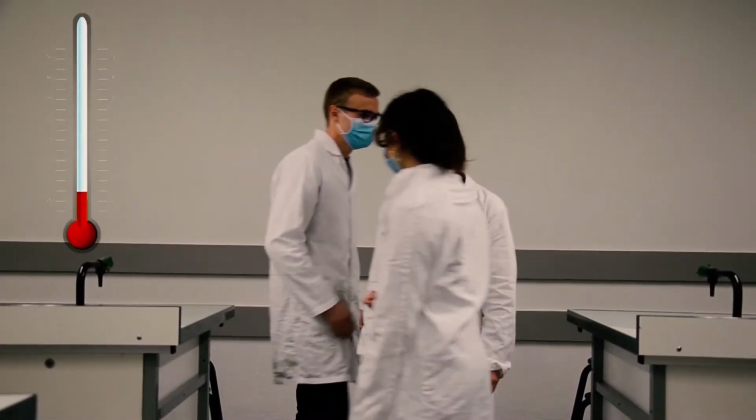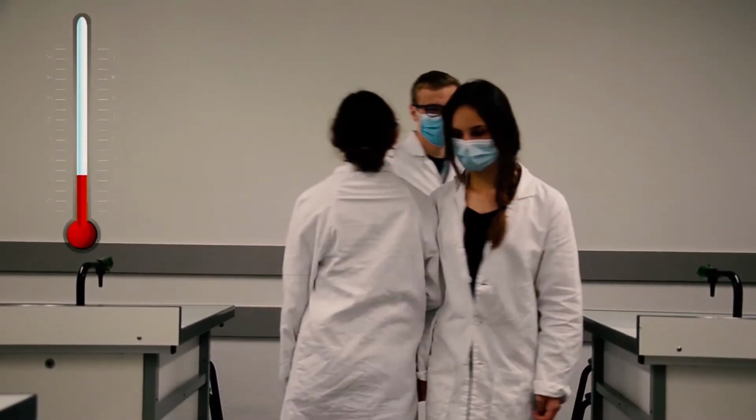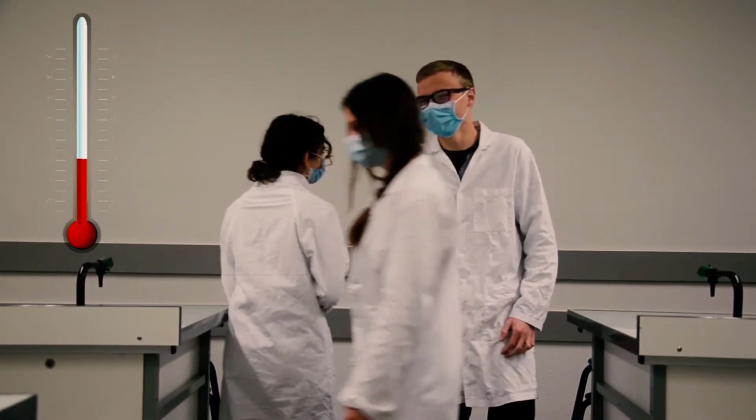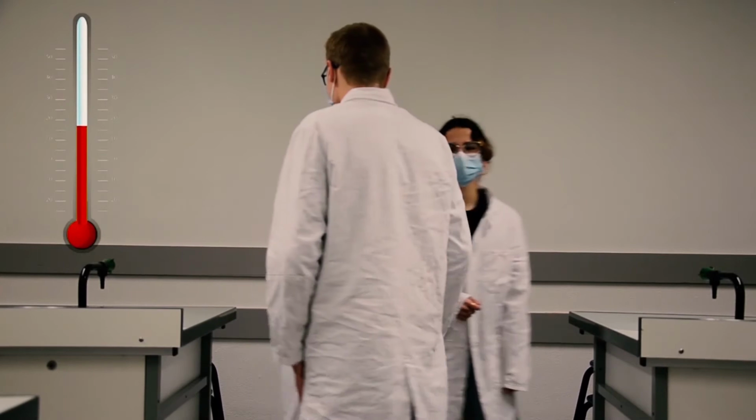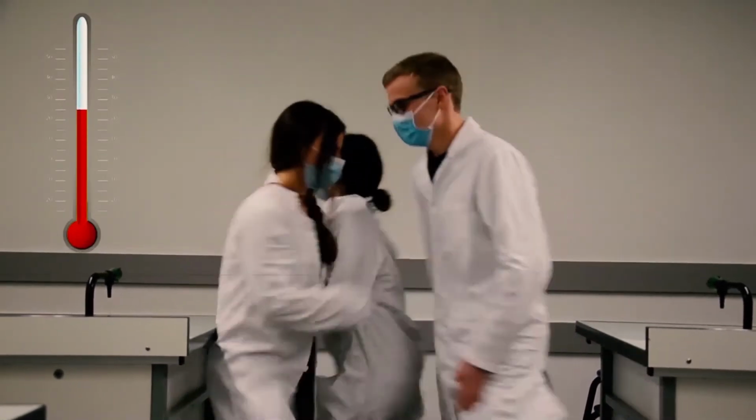We start the chronometer and we stop it when the reaction is finished, when the solution is totally transparent. We can see that this reaction is quicker than this one. But why? It's because when the temperature increases like here, in reality, particle agitation increases too, and like this, they collide more, so the reaction is faster.